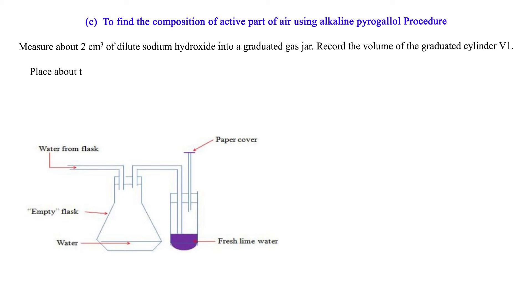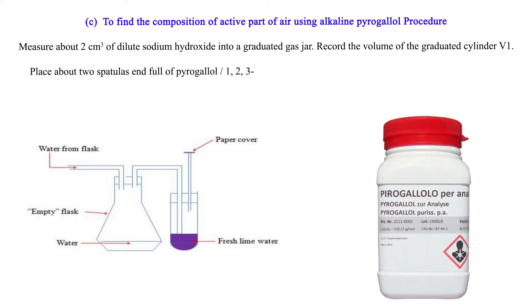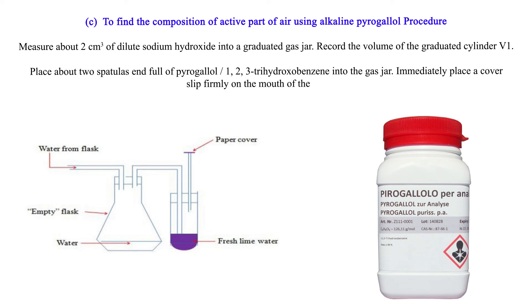Place about 2 spatulas-full of pyrogallol (1,2,3-trihydroxybenzene) into the gas jar. Immediately place a cover slip firmly on the mouth of the gas jar. Swirl thoroughly for about 2 minutes.